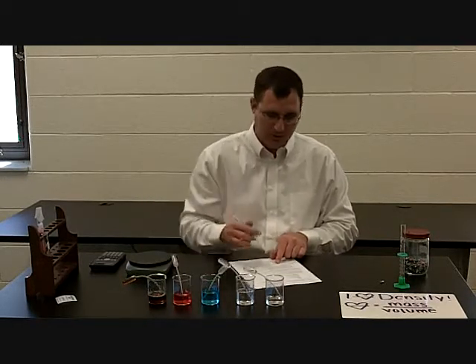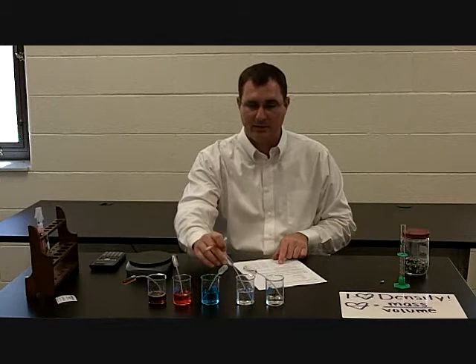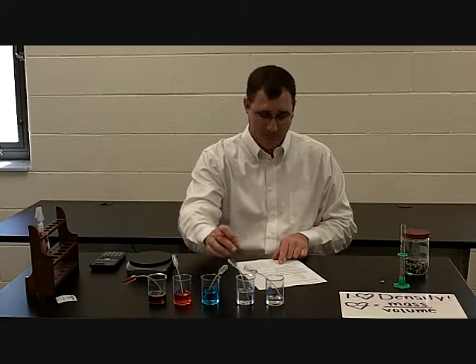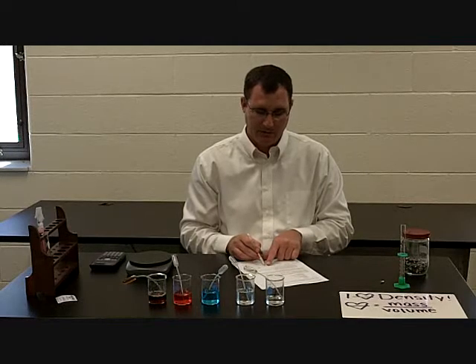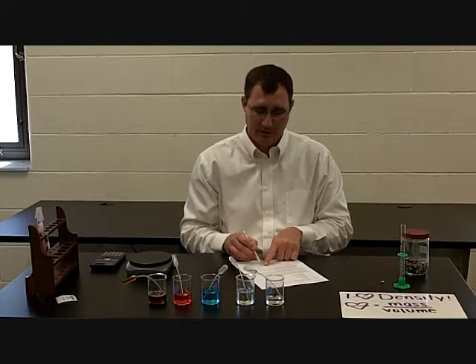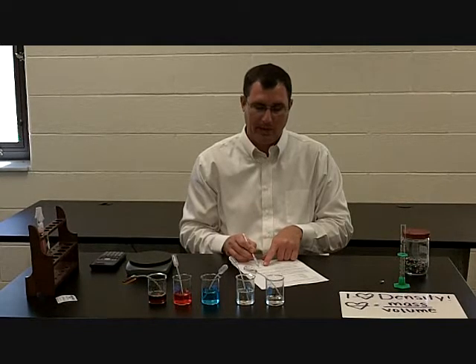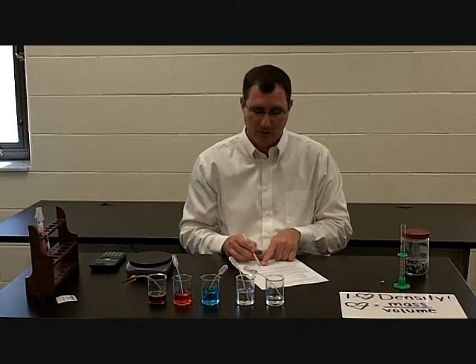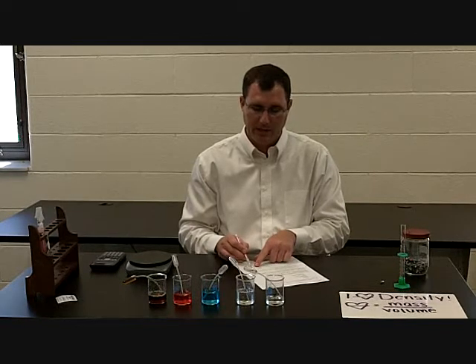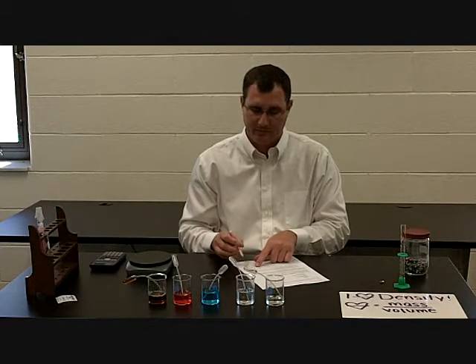I'm going to do the same process: subtract out the mass of the pipette. So 4.9 minus 0.9 grams gives me 4.0 grams for the actual mineral oil itself. Divide it by 4.8 milliliters because we know that's how much the pipette holds. So 4 divided by 4.8 gives me 0.83 grams per milliliter.